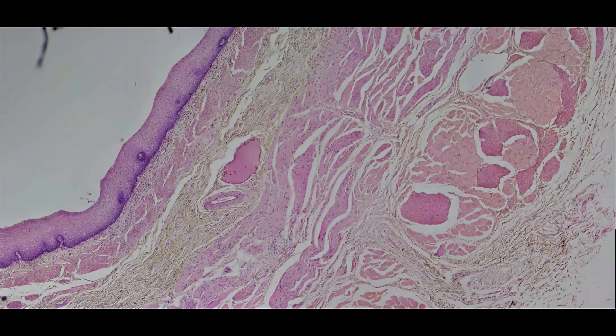Looking at this, it's the same layers that we've been looking at, now just on a slide that has a lighter pigmentation. Looking towards the top, we see three layers: the stratified squamous, lamina propria, and muscularis mucosa. The fourth layer down will be the submucosa, laying over top these two layers of the muscularis externa.